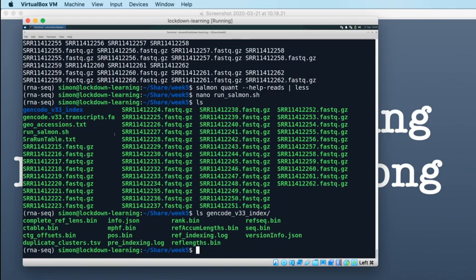It's essentially a lot of files produced by Salmon for the purposes of easily searching through that transcriptome for places where your present read matches that transcriptome. So you've got a bunch of files in there. Most of them are binary format files, which Salmon uses to search. But the name of our index is the name of that directory. So gencode, in my case, gencode_v33_index.